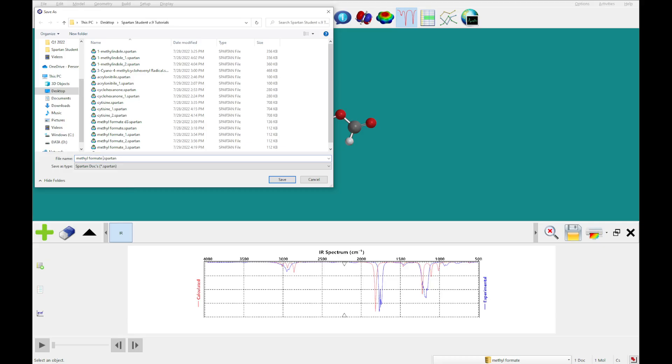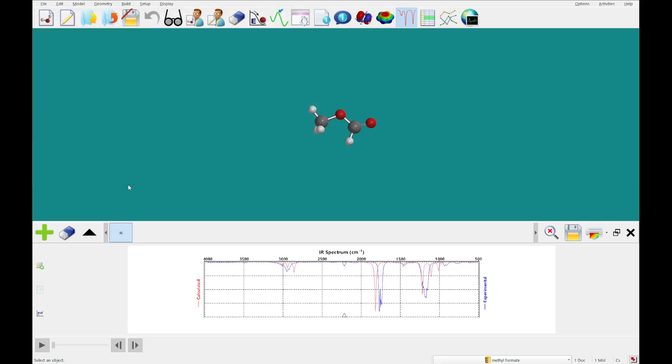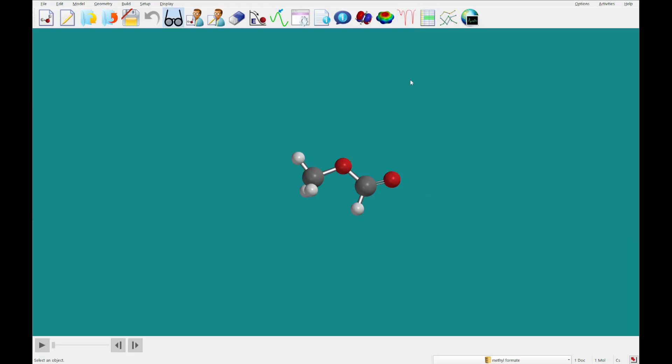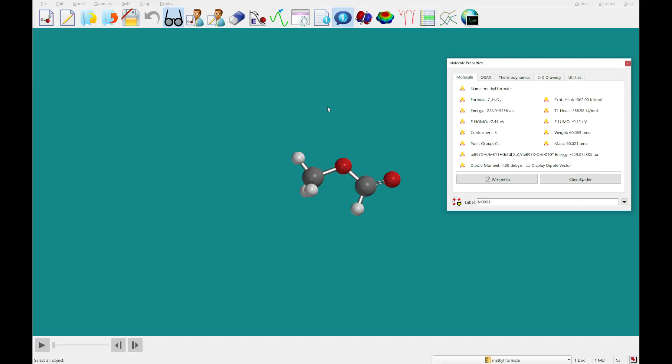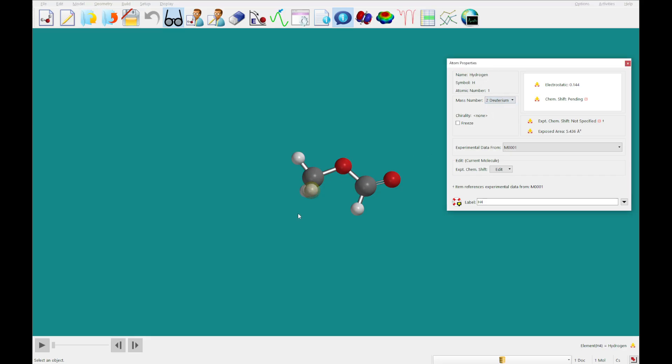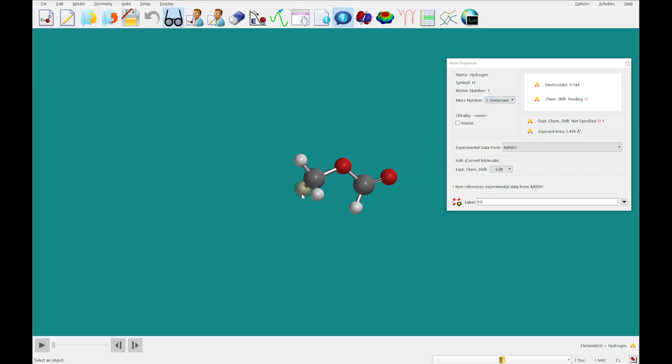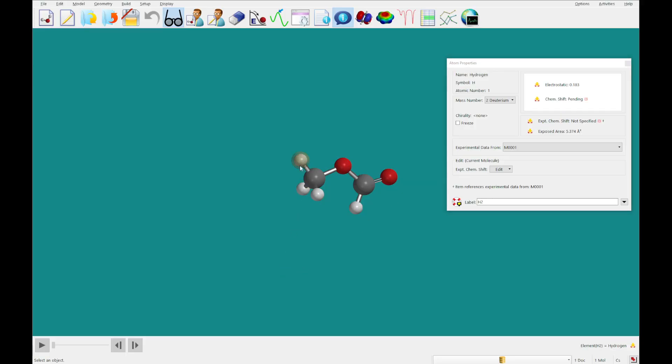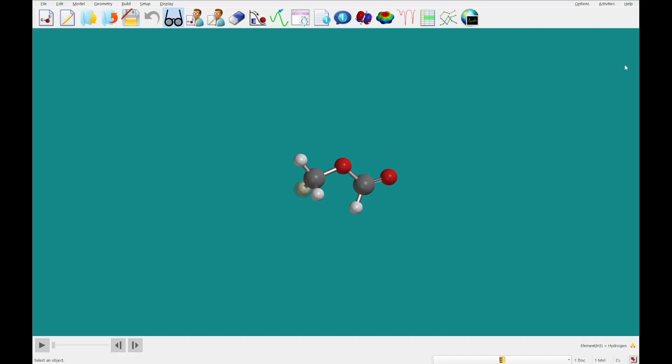We're going to call it methyl formate D3, and I am going to exit out of the Spectra panel, click properties, and then I'm going to click on one of these methyl hydrogens. We're going to change its mass number to 2 deuterium, so we've got these hydrogen isotopes, deuterium, on each methyl hydrogen.